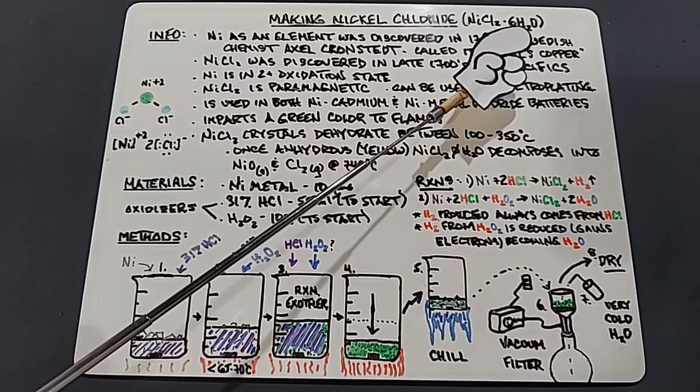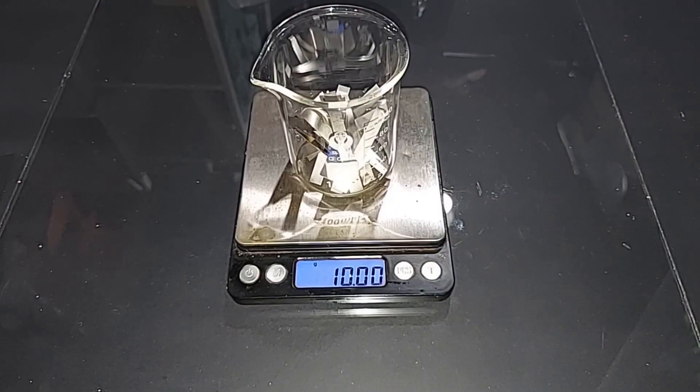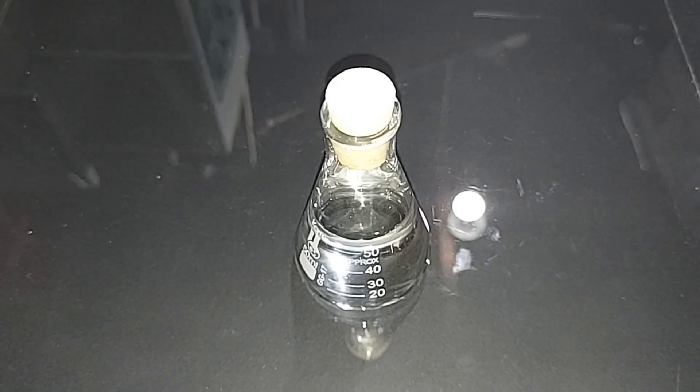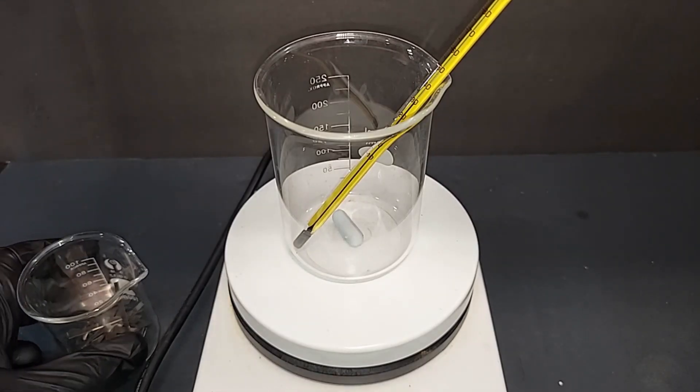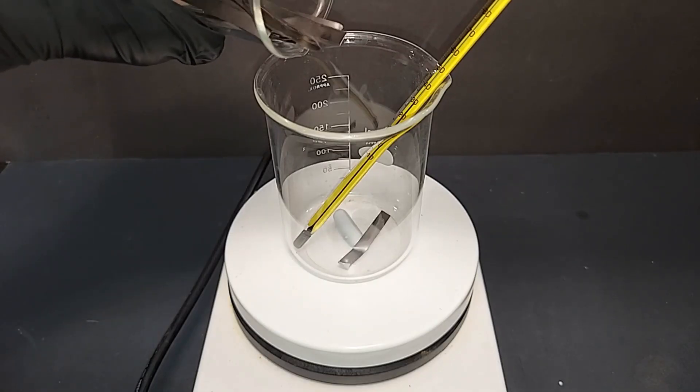Right now, 10 grams of solid nickel strips pre-weighed, 55 milliliters of 31% hydrochloric acid pre-measured. I'm using a 250 milliliter beaker here. You see it has the magnetic stir and the thermometer and they're ready to go. I'm just going to transfer those nickel strips into here.